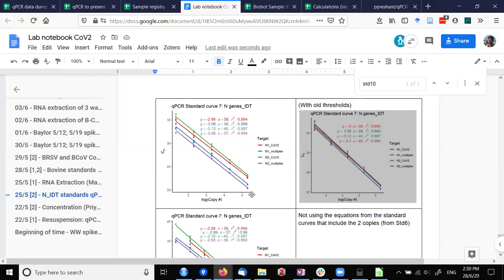Yeah. Yeah, so I think to be really precise, you would start with RNA standards. So in that case, you would take this DNA thing, and what I've seen other people do is they buy this in vitro transcription kit. So it transcribes the DNA into RNA by adding that polymerase, the RNA polymerase. Oh, okay. DNA, I keep forgetting. Yeah, it's the polymerase that makes RNA from DNA. I think it's called RNA polymerase.